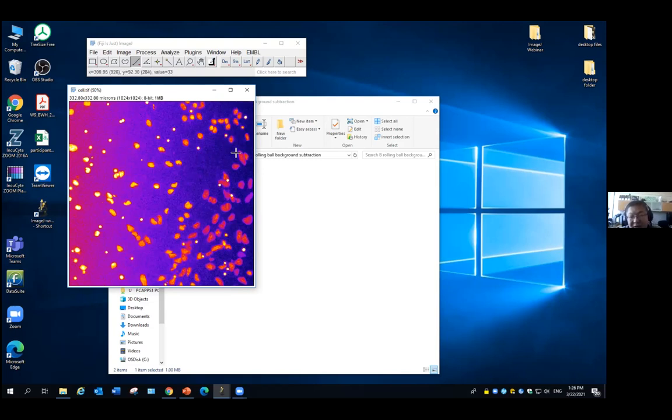We want to first cut off the background, then do the stretch coding. But we cannot use a single background value for all of it, because this part has a higher background than this part. So I want the program, when it cuts off the background, to do a calculation to cut off the local background. The program can guess what the background is here. ImageJ's local background subtraction has many algorithms, and probably a few new ones come out every week from the computer science people. But ImageJ applies a very classic one, called rolling ball subtraction.